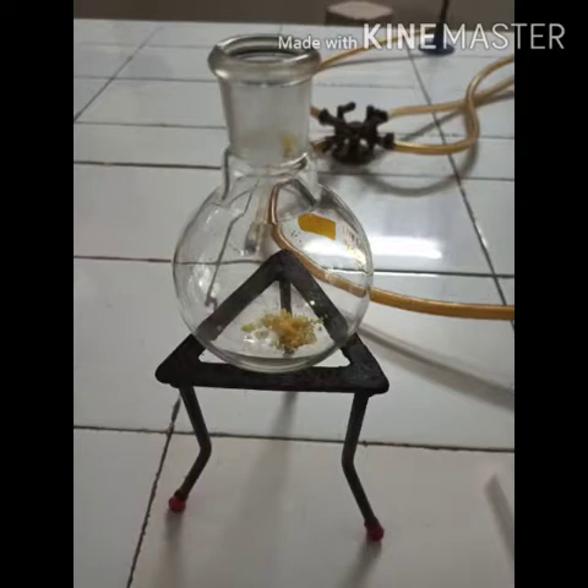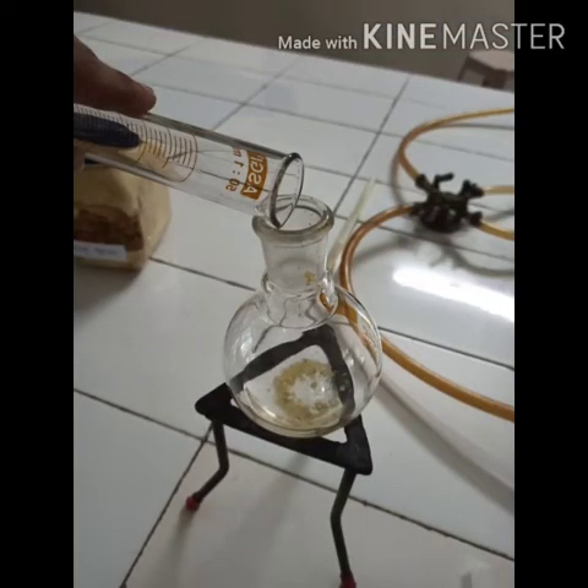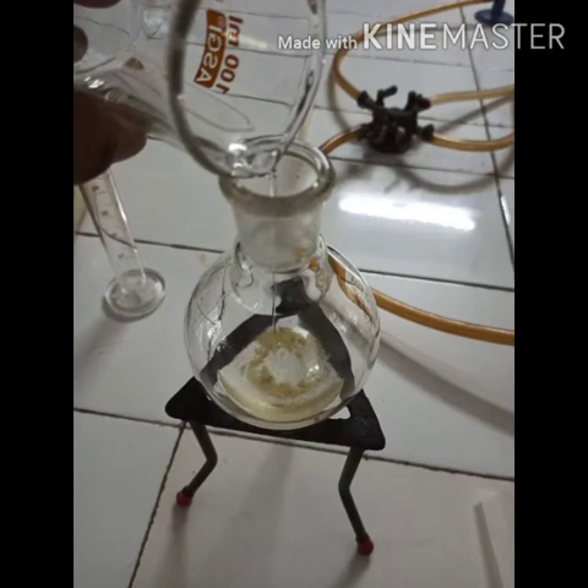All the ingredients were then transferred into round-bottom flasks in a sequential manner. Firstly, sodium metal was transferred to the round-bottom flask. Then diethyl melanate was added, followed by 25 ml of absolute ethanol. The contents were constantly shaken after each addition.